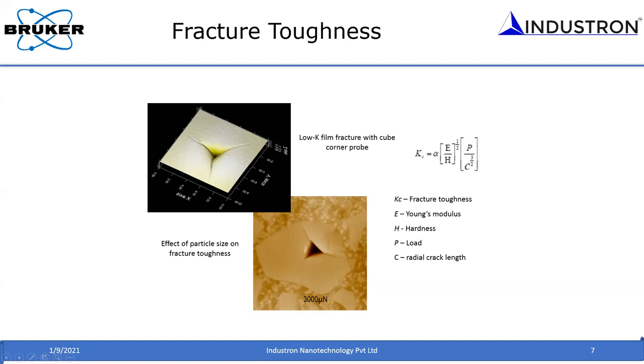This is something also important. So I thought it is very important to put this particular slide to convey that message. One thing that you have to be careful is, while using this formula, there are certain limitations. For example, up to what extent you can use this equation. So if you follow that, and then you can do a careful measurement, and then you can do this pretty nicely. It may not be very quantitative in a typical fracture toughness that you measure, but this is at least a kind of helpful way can give you semi-quantitative information about the fracture toughness of the material.